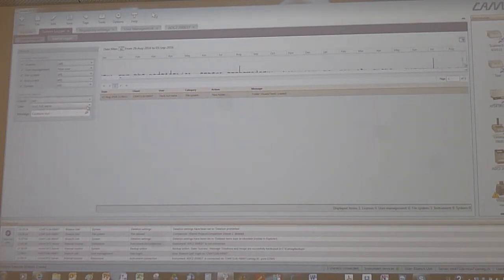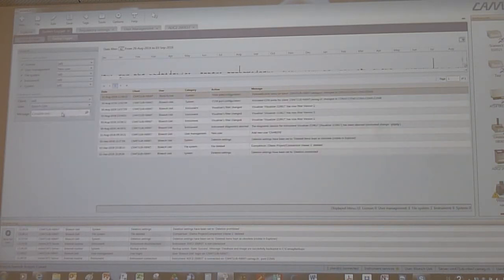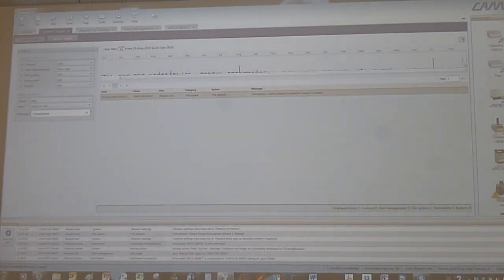And also, so I can search. It's a full name search. So if you search something, really you can find it. And I think this is a side thing, not really a functionality. But if you show that to a QA guy or QC guy, he will be happy and he will say, okay, fine, it's okay.